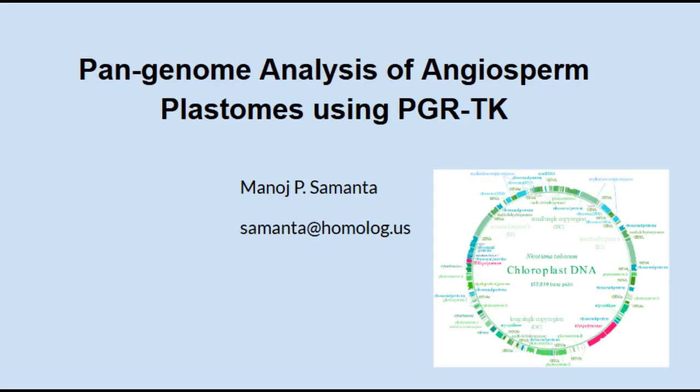In this presentation, I'm going to talk about the pangenome analysis of angiosperm plastomes using PGR-TK. Let me start with explaining some key terms. Pangenome refers to the comparison of a large number of genomes. Angiosperms are flowering plants, plants you are all familiar with.